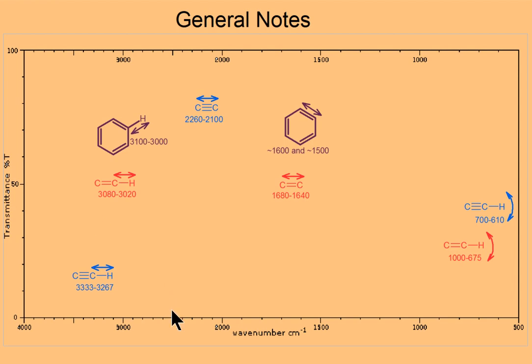Moving on, we also have, of course, things like the alcohols. Alcohol is very distinctive with that oxygen to hydrogen bond stretch, which is moderate to strong, and it's also very broad, often starting at about 3500 and finishing at about 3000. Looks a little bit like someone put a thumb onto the page and we just drew a curve around their thumbprint. Very distinctive and very broad. We've also got the carbon to oxygen single bond stretch, which will be somewhere between 1200 to 1000.